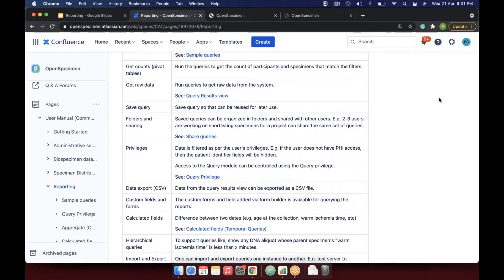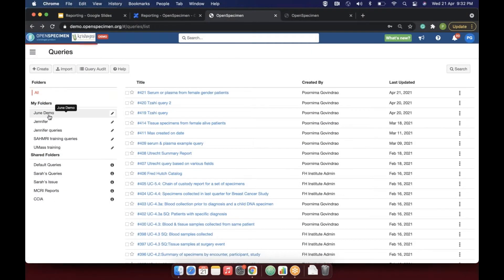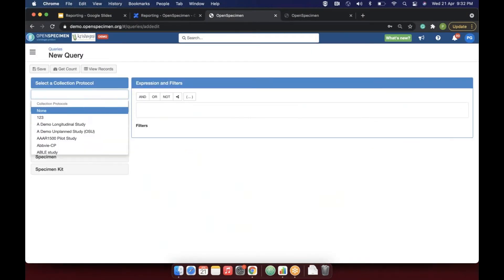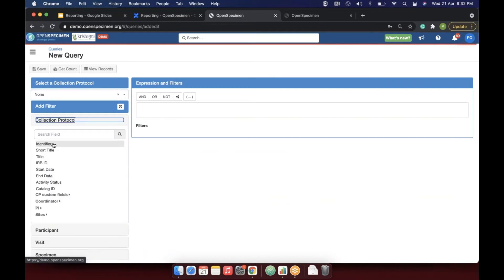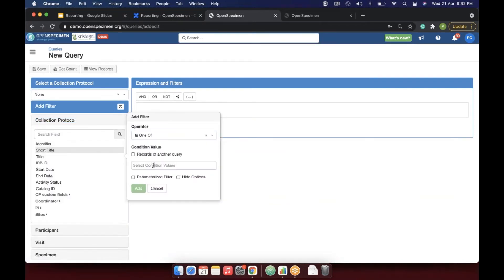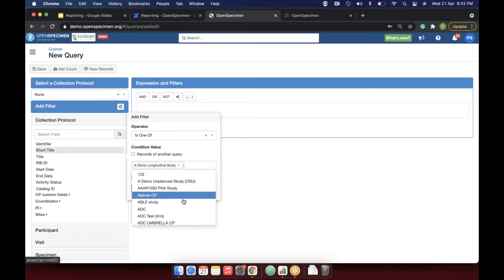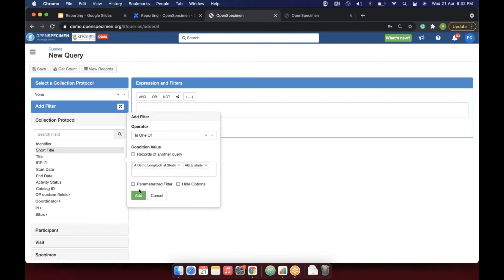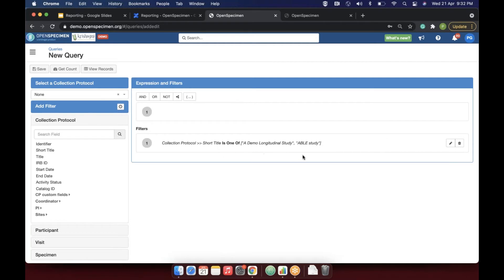Regarding cross-protocol queries: yes, you can query across protocols. When creating a query, instead of selecting a single protocol, add a collection protocol condition using 'is one of' and select multiple protocols. This lets you query specimens across different protocols simultaneously.